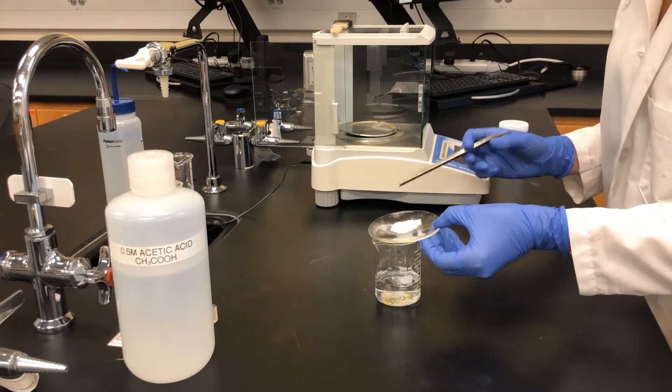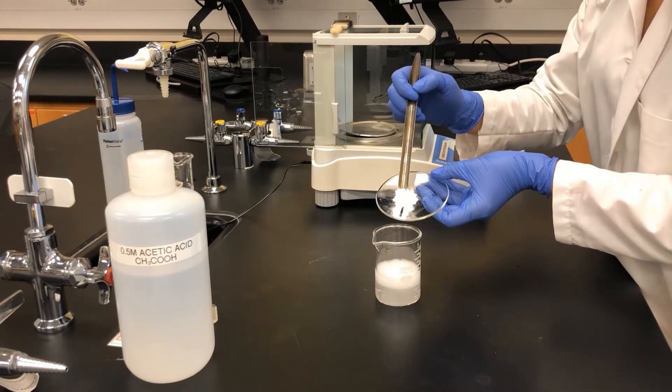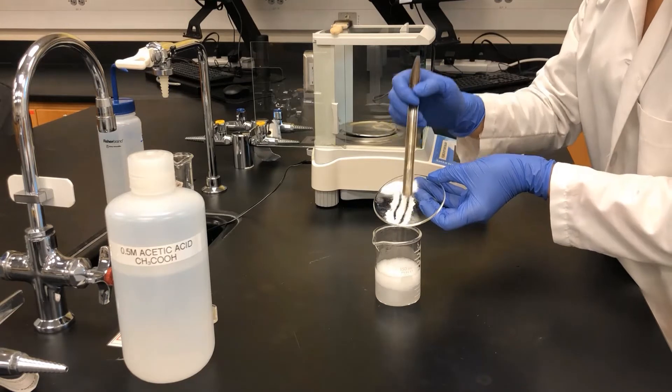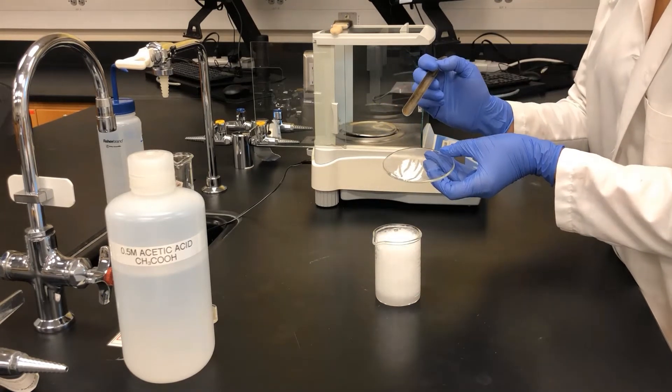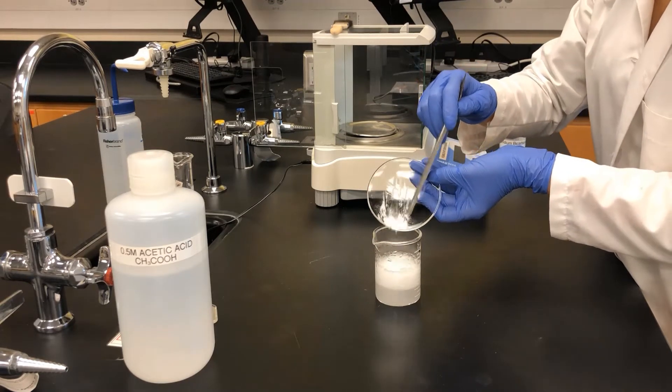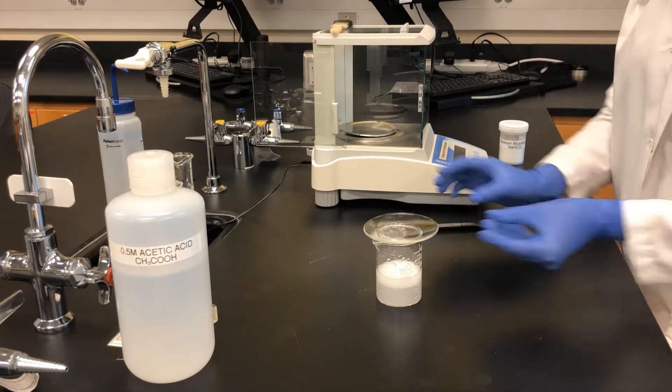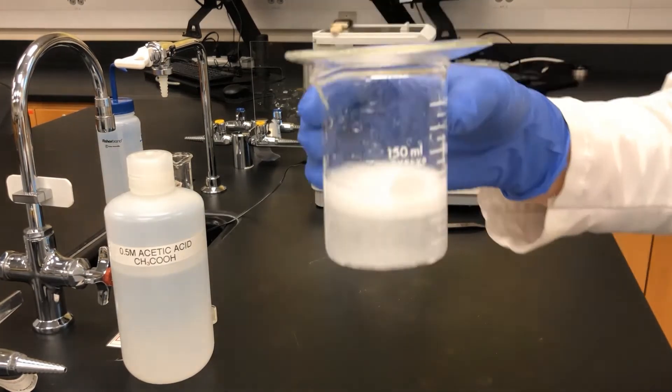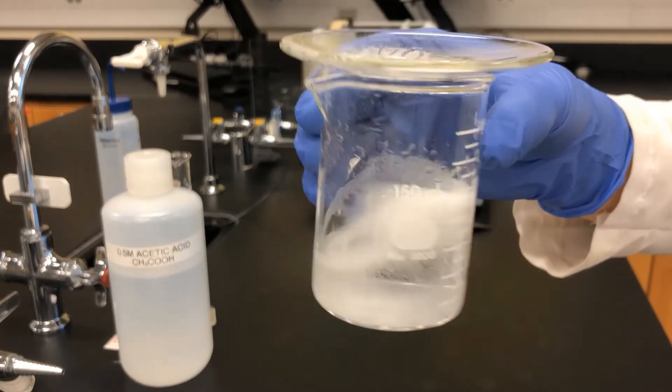A scoop is used to carefully and slowly add the sodium bicarbonate to the beaker. What is happening in the reaction? What gas do you think is being produced? To ensure that all the sodium bicarbonate reacts with the acetic acid, the beaker is swirled.